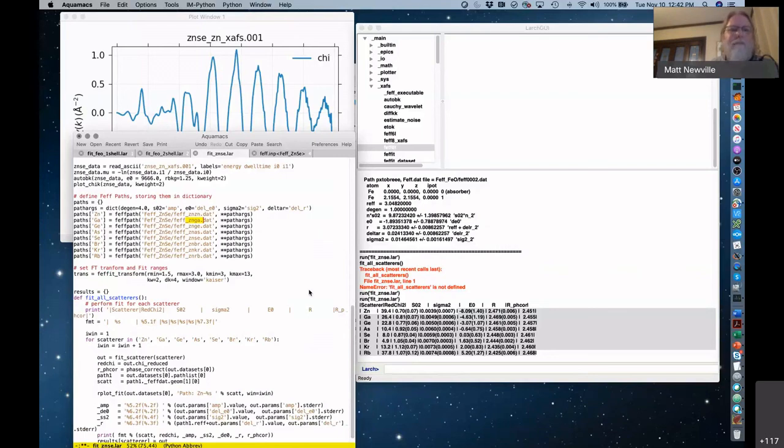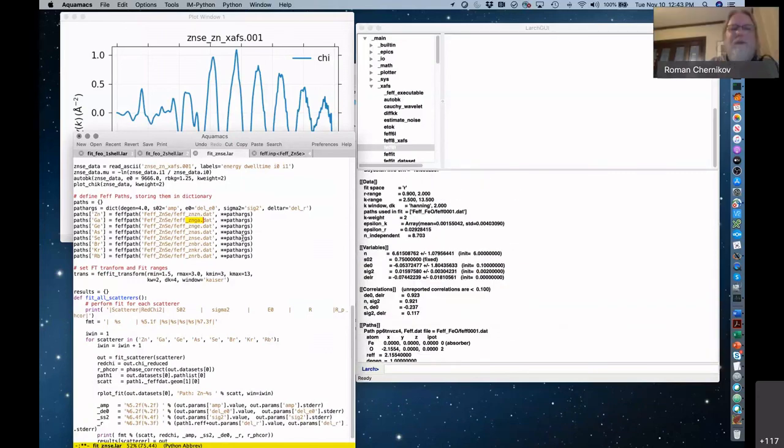Yeah. To me, having the possibility to write a script is already a huge advantage. You automate something and leave all the dirty work to the machine to calculate. I would also say the script aspect is self-documenting.